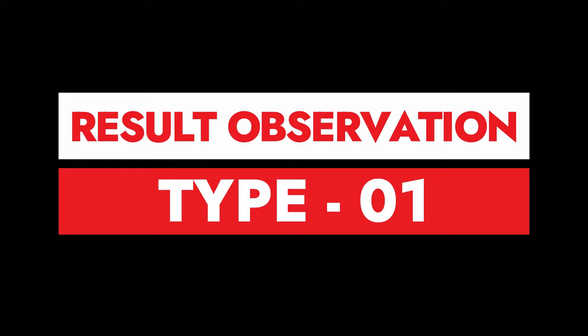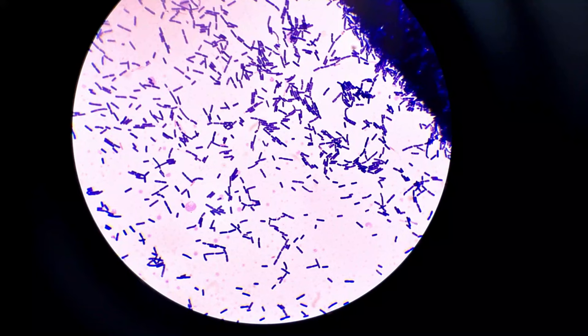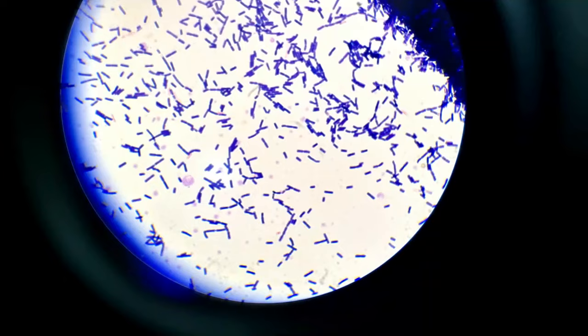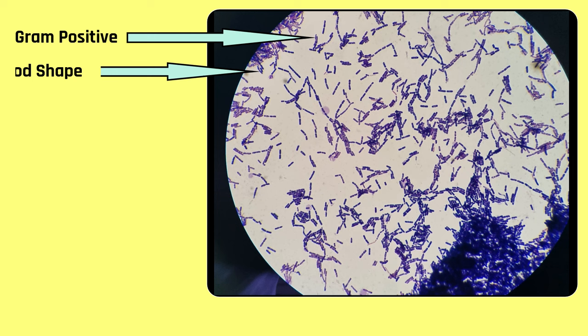Let's observe the original microscopic view. You can see that the bacteria in this view are purple or violet in color. Bacterial shape is rod. Some bacteria are seen in a chain-like arrangement. So the interpreted result of this view is, the bacteria is gram-positive, rod-shaped, and in chain arrangement.